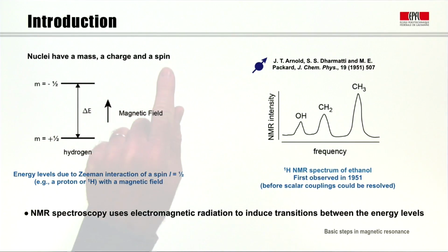you know, but they also have a rather peculiar property called a spin. Initially, in the early days, that is to say in the 1920s, when spin was first discovered, it was believed that it was sufficient for a nucleus to rotate about an axis, and a charged particle rotating about an axis will generate a magnetization. And that was believed to be the origin of nuclear magnetization. It turns out to be more complicated than that.